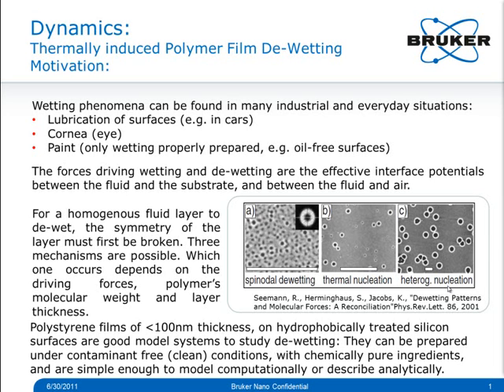The collaborators, who also made the sample, are the groups of Professor Ralf Seemann and Professor Karin Jacobs, husband and wife, and both at the Universität des Saarlandes in Germany. Both are long-term Veeco Bruker AFM customers and excellent references. They have spent some academic time in Santa Barbara. Professor Jacobs is an early BioScope Catalyst customer. Professor Seemann was the first Dimension Icon customer.